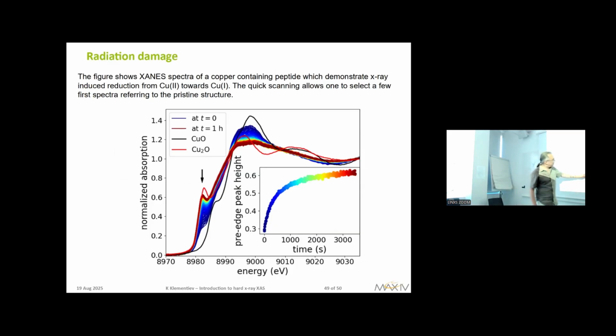But initial first few spectra we could use, which is a demonstration that copper is sensitive, but iron with the same material, but that has iron, is not. So yeah, you first demonstrate it works or it doesn't, and then you do something. Measure quick, or sometimes you feel lucky, it just is not sensitive.